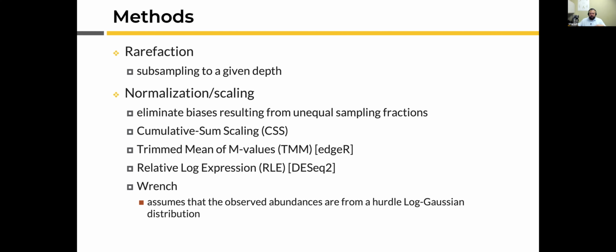So in terms of microbiome data, you would do rarefaction at the sequence level. So you would take all of your sequences for sample A, the 10,000 sequences, and at random pick 2,000 of them. And then you'd do it again, and then you'd do it again, and sort of do a permutation based on that. But the general idea is that you take your smallest sample, or the smallest sample that you're willing to keep. So if you have some samples that have 10 sequences and your largest samples are 10,000, you're probably not going to want to sample down to 10.